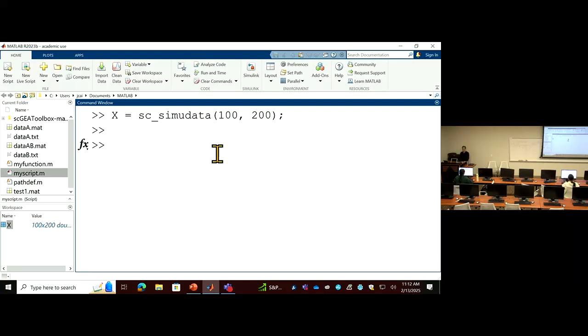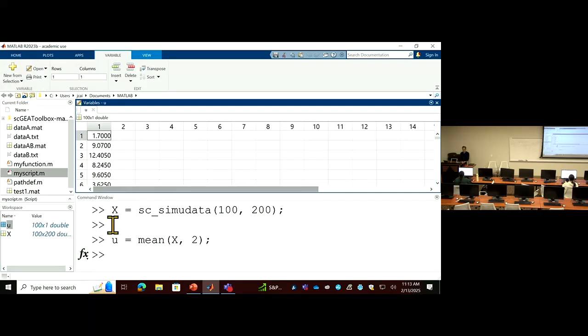So we know you can compute a mean and see that you have an average. Use the function mean by the rows. This will be the genes' average. Let's see mu. If you get the values, you see this is by 100, okay, 100, by rows.